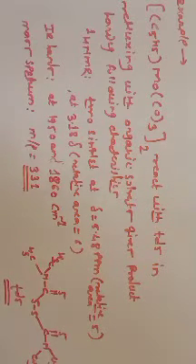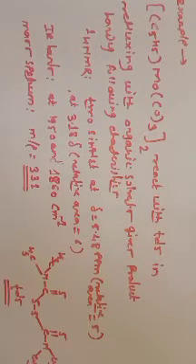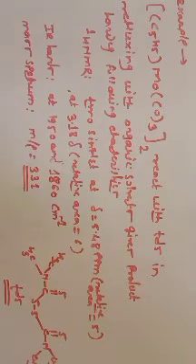Good morning, dear student. In the previous lecture, we already discussed the C13 chemical shift value and H1 chemical shift value for the organometallic compound. So in today's lecture, we are very much interested in solving examples based on this C13 and H1 NMR spectral data. If you consider the first example, this is an organometallic complex.